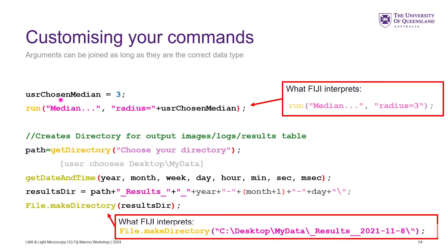Hopefully you're aware now that the way Fiji works is it turns all of this into a string and then resolves it. So if we have `user_chosen_median = 3`, we can run the median command and it would resolve or interpret as that. So you can have a pop-up box asking, how blurry do you want your image? Pick a number between 0 and 255, and it would be ready to adjust.